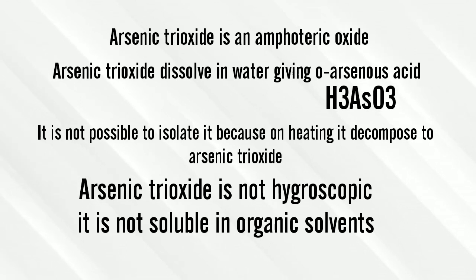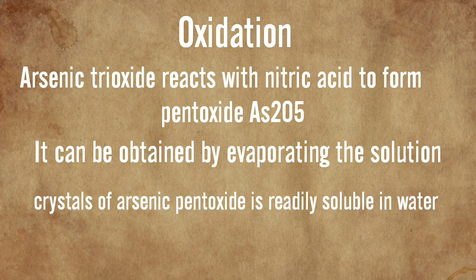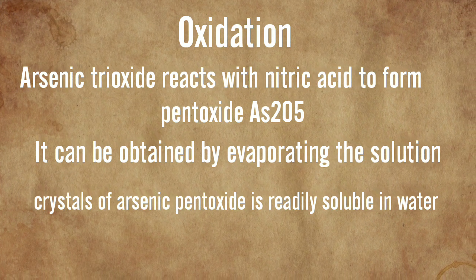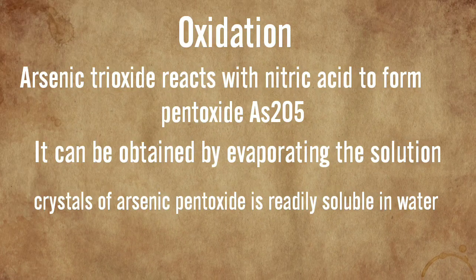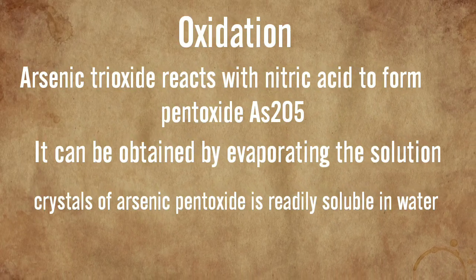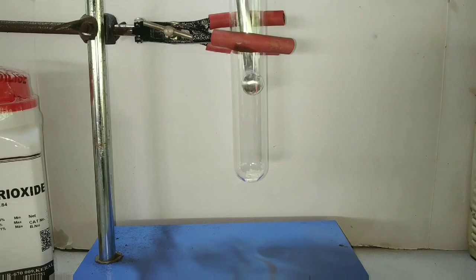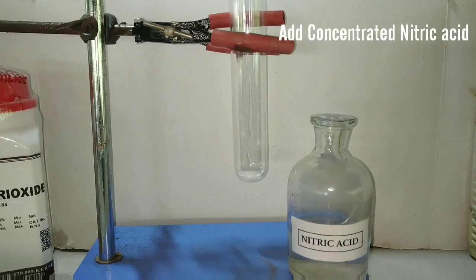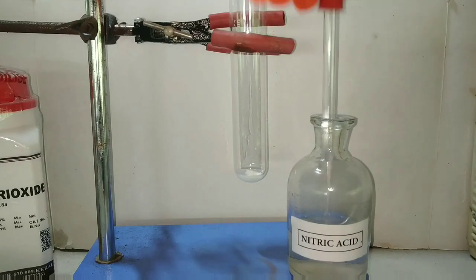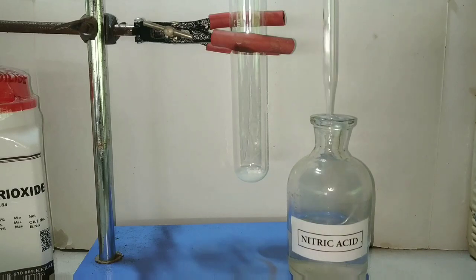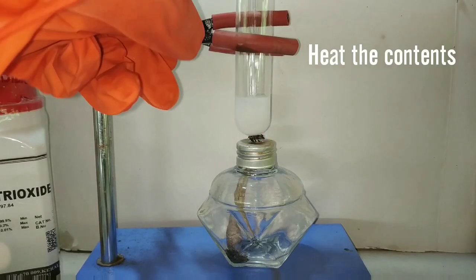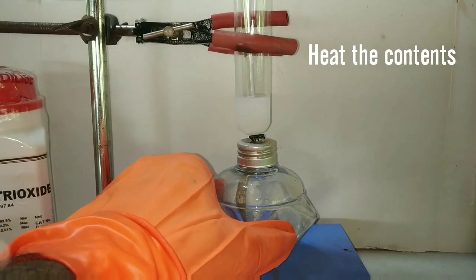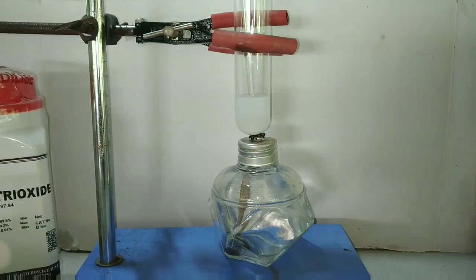Now we will see the oxidation of arsenic trioxide. I am using nitric acid here and it forms arsenic pentoxide. First of all we will be adding some solid arsenic trioxide into the test tube. Now we will be adding concentrated nitric acid. Concentrated nitric acid acts as an oxidizing agent. You can either use concentrated nitric acid or hydrogen peroxide. After adding the nitric acid we will now heat the contents of the test tube so that the reaction will take place much faster.